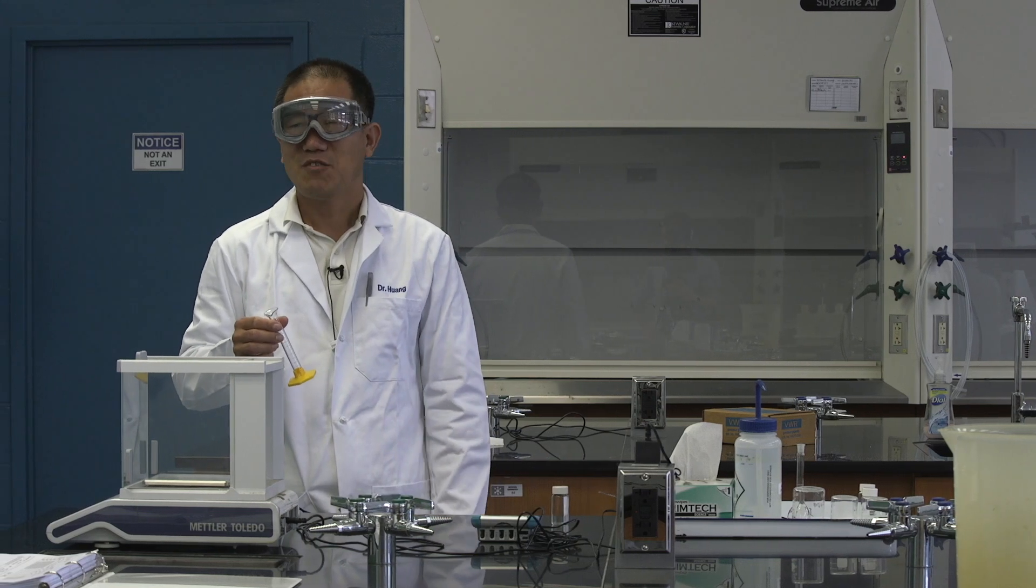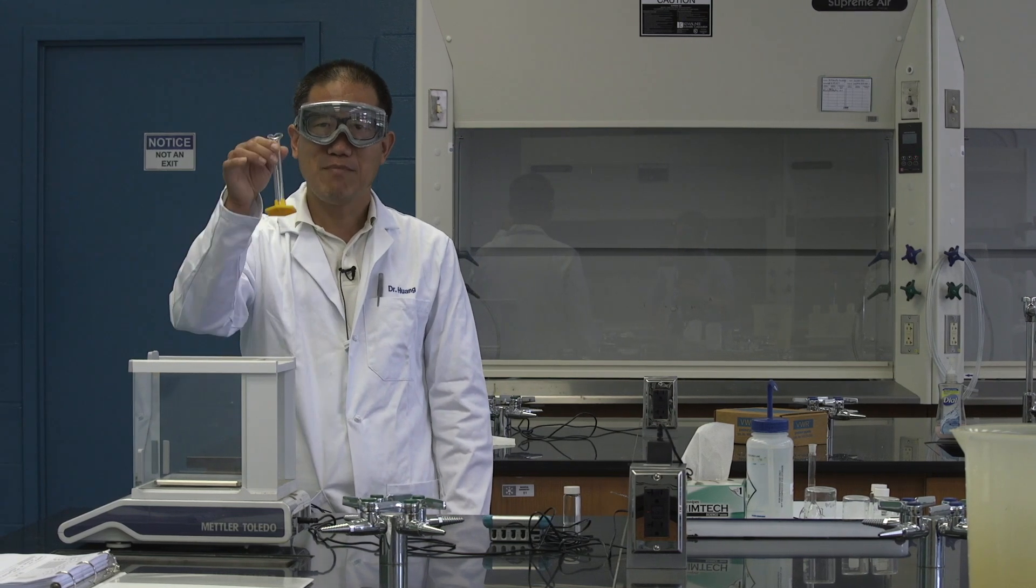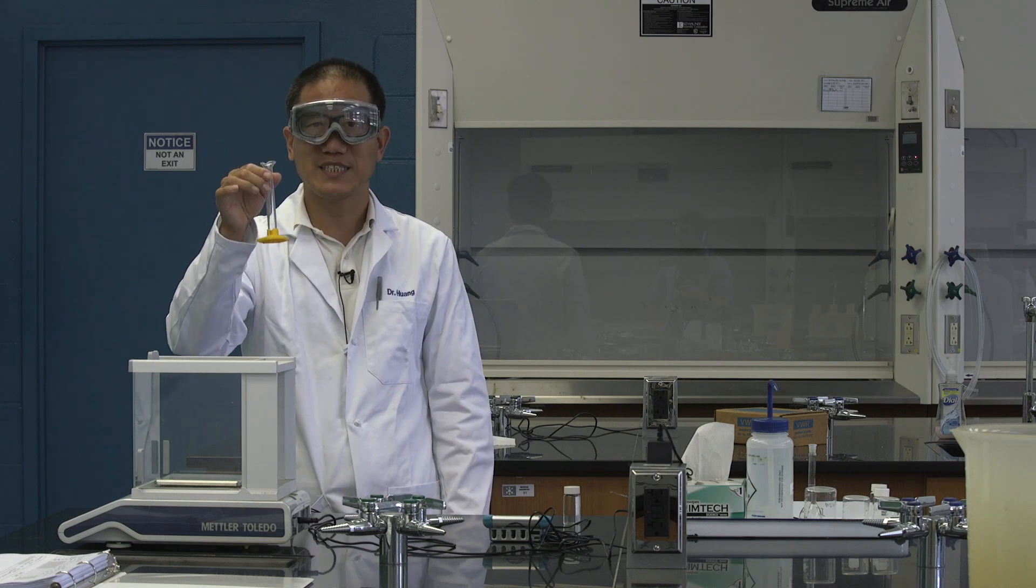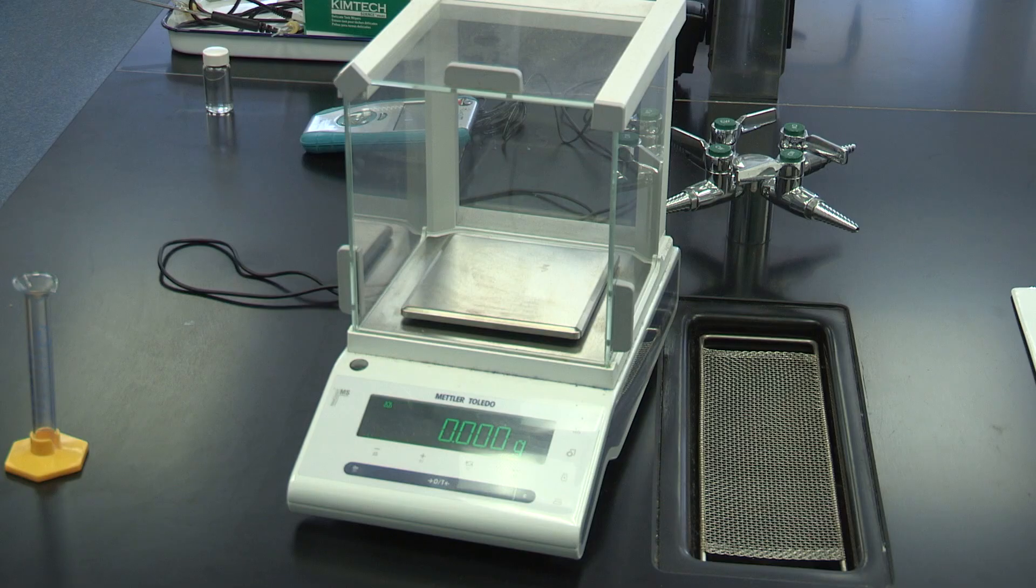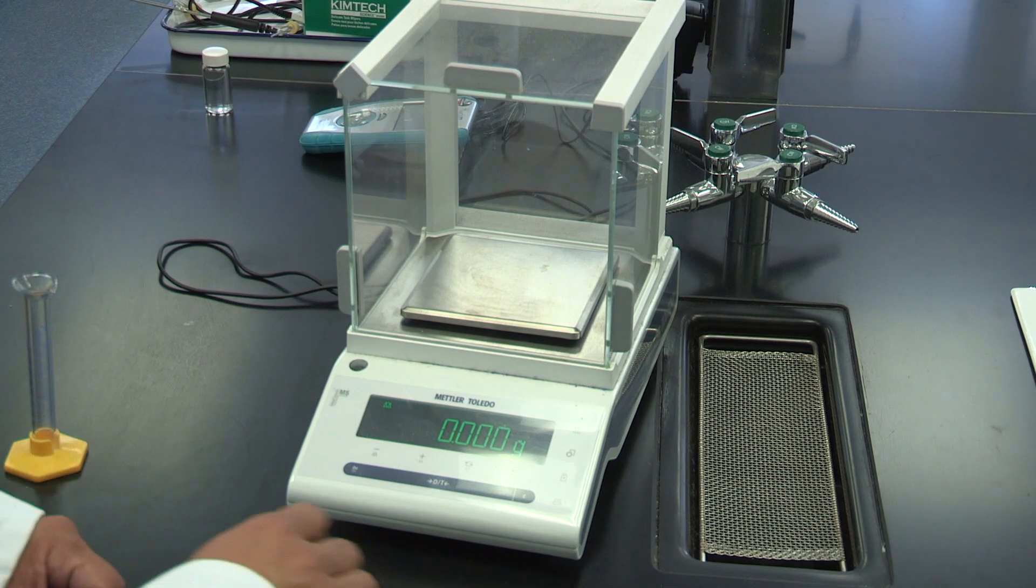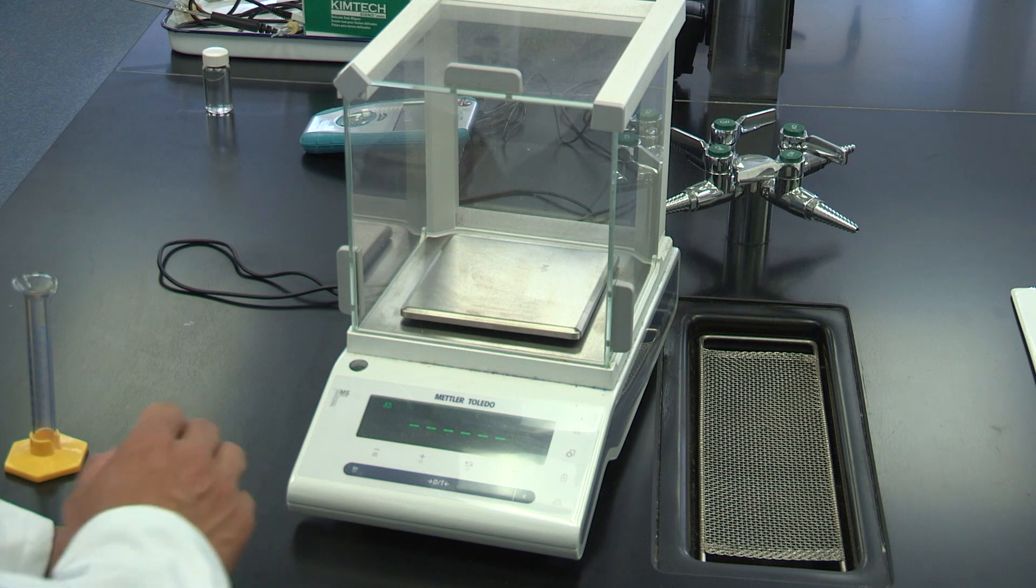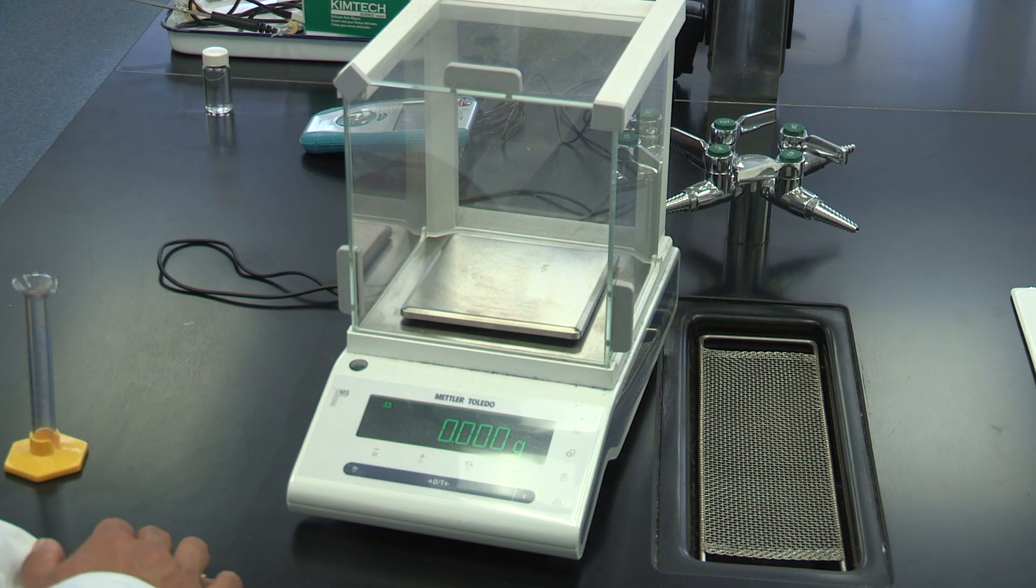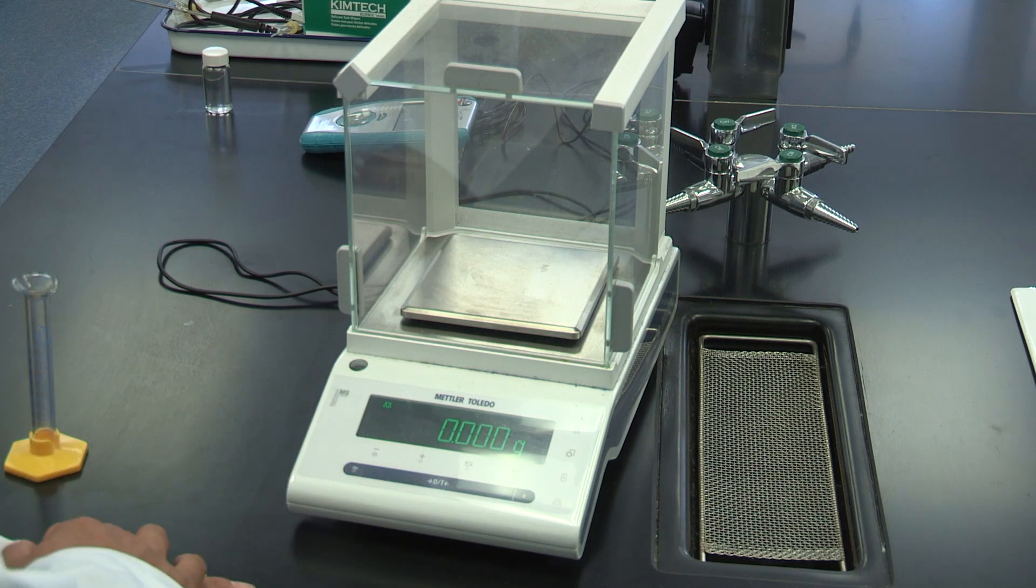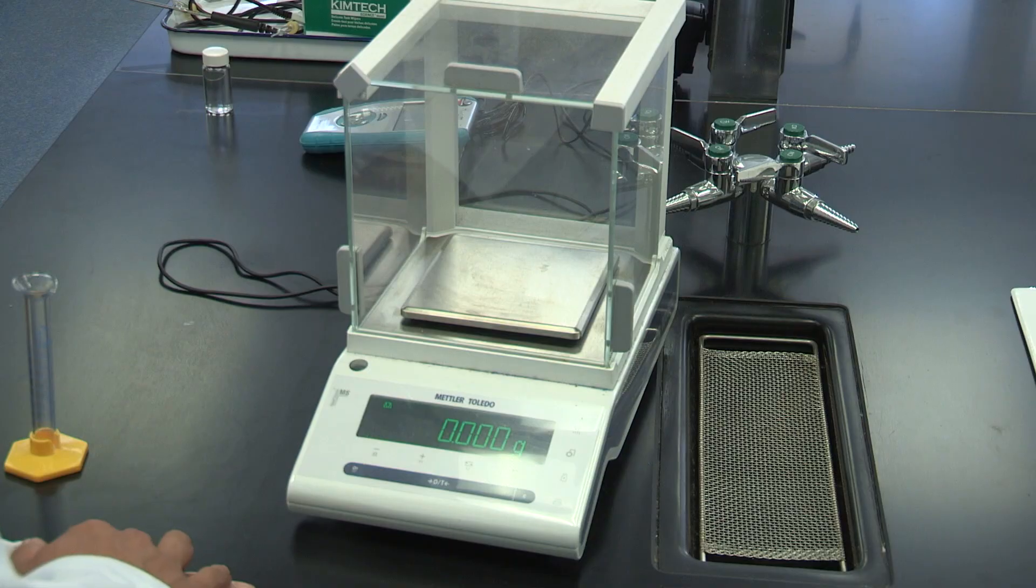What we do next is we have to determine the mass of the empty graduated cylinder. Make sure you have to do this in the first step. This is the electronic balance. Make sure if it is not on, press the button on the left. If the reading is not 0.000 grams, you press the button in the center. If the last digit is 1 or 2, that's fine.